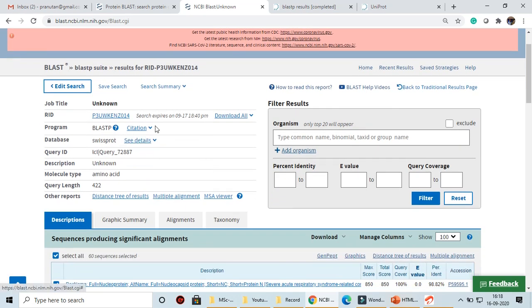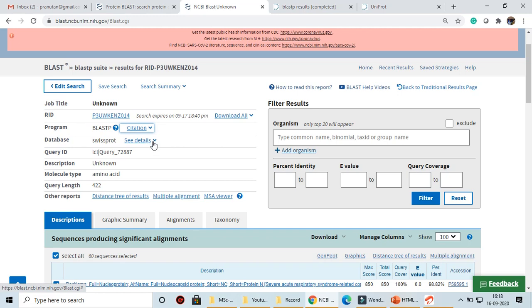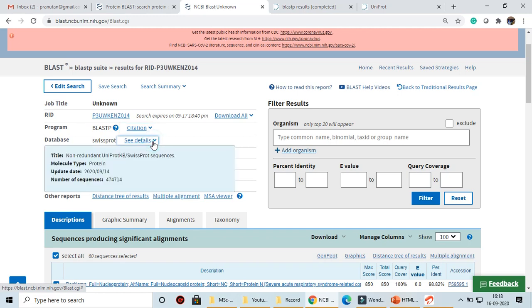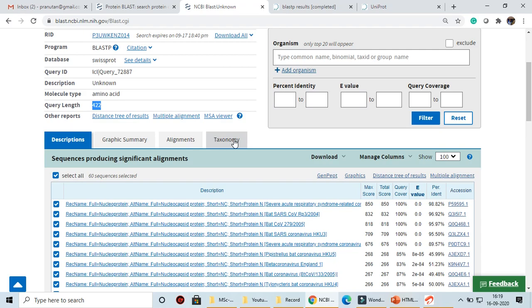Once you get the results, here is how to interpret them. The program name was BLAST — if you are writing a research paper you can cite it. The database searched was Swiss-Prot; as of 14th September 2020 there were around 474,714 sequences. Your sequence was matched against all of them. The top 100 results are displayed. The query length of the unknown amino acid sequence is 422.